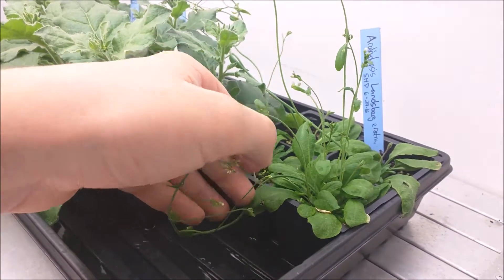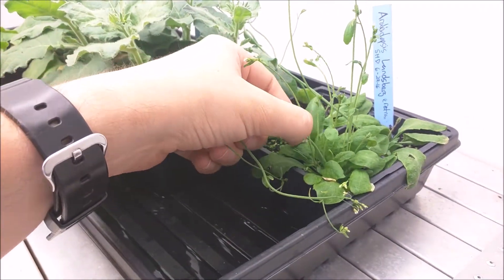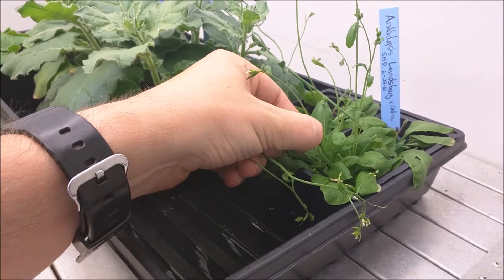Today we're going to transform Arabidopsis with Agrobacterium. We need just-opened flowers, so if yours are too old, you can remove the stems and they'll grow back.